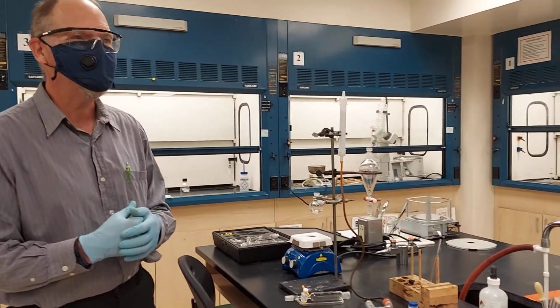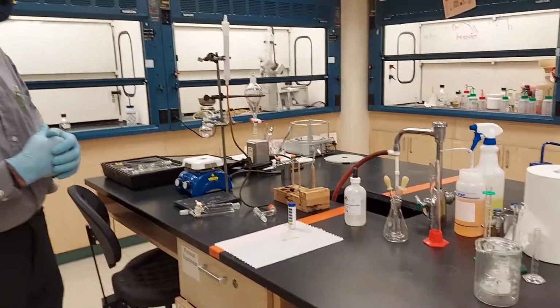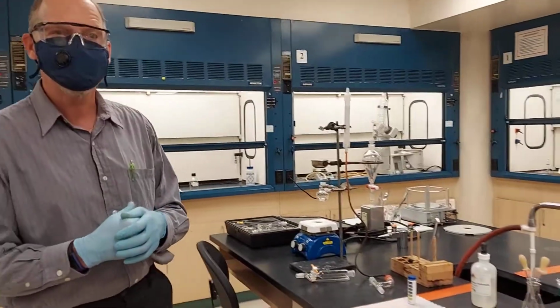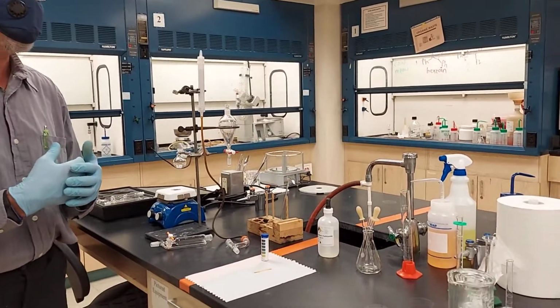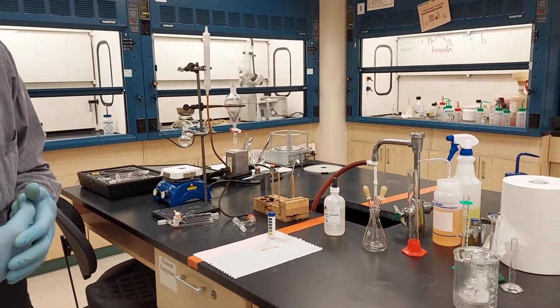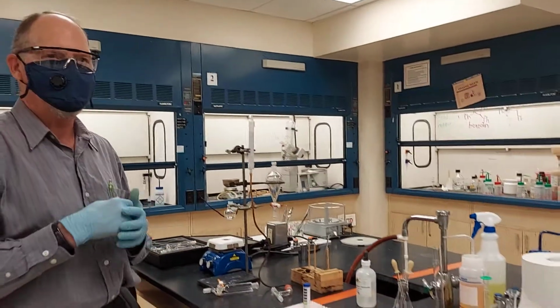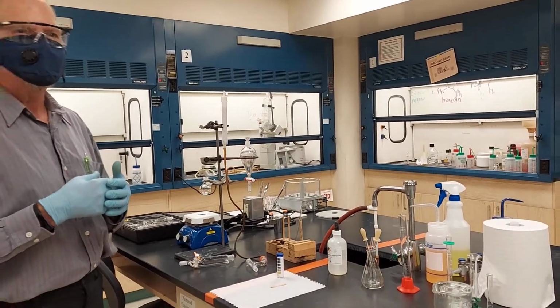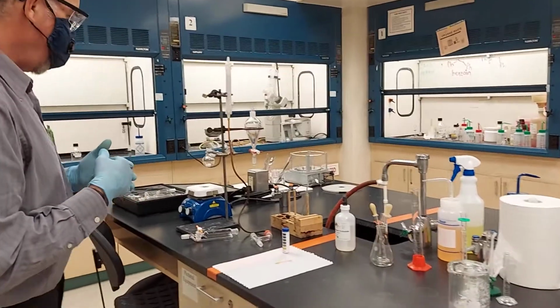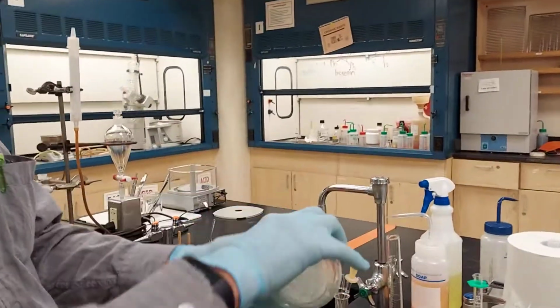Experiment 27 is the acetylation of ferrocene, and we're scaling it up. This is real scale chemistry, unlike the micro scale chemistry you've been doing all semester. So what does it say we're going to start doing on the sheet? To a beaker, and we have lots of beakers.